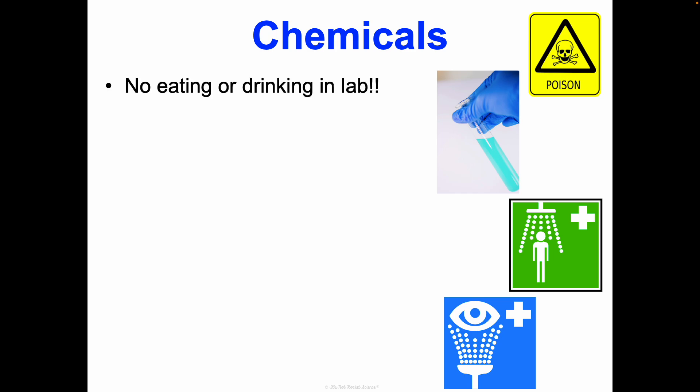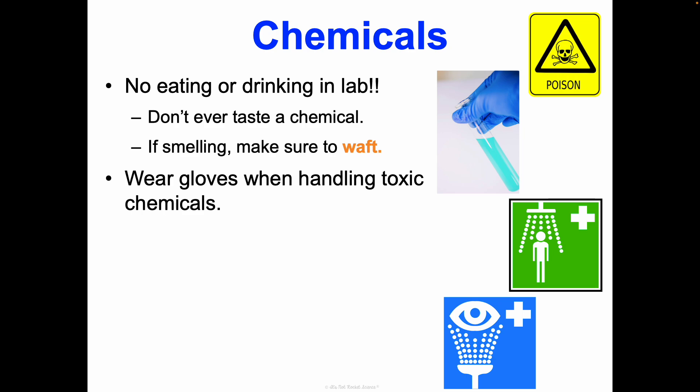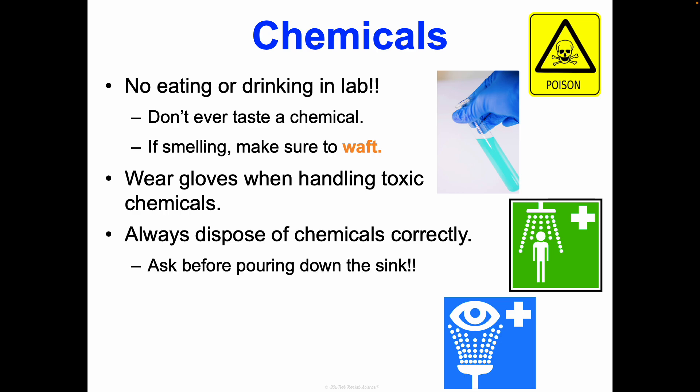Let's talk more about chemicals. We're never going to eat or drink in lab — even on non-lab days, because someone in a previous or later period may have been doing labs and there may have been chemicals on the desk. You should never taste a chemical, ever. If you're smelling any chemical, you have to waft it — I will show you how to do this in person. You never want to take a big whiff directly; that can burn the inside of your nose. We'll wear non-latex gloves when handling toxic chemicals, and always, always, always dispose of chemicals correctly. Never just pour something down the sink — most chemicals have a special disposal method. And if you spill something, tell the teacher so we can help get it cleaned up.